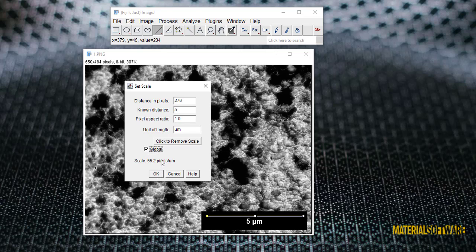The third option must always be 1. And the fourth option must enter the line length unit. Since our unit here is micrometer, we enter um. Now, if our unit is CM, we enter CM, and if it is nanometer, we enter NM.